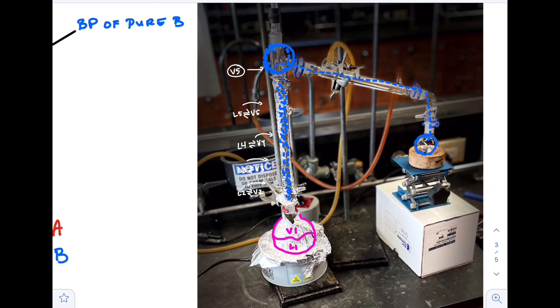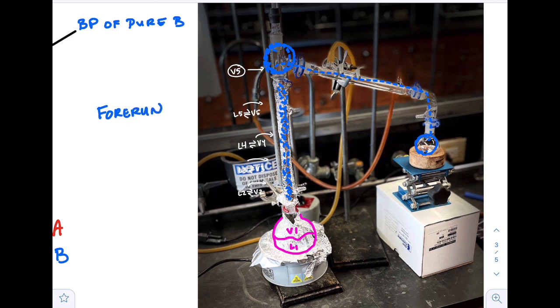But one little vocab word that I want to give you is the forerun. That's basically the first fraction. And so in the case of ethanol, you want to typically discard the forerun fraction, usually in general, but especially in this case, because that forerun fraction is going to contain a lower boiling point compound called acetaldehyde, and you guys will need to figure out how that forms, but it's just a byproduct of the oxidation process when you ferment sugar. Okay, so again, forerun is the first fraction. Usually you just get a little bit, you toss that out, switch it out for the good flask, and then you collect, right? Just depends on what scale you're doing your stuff at.